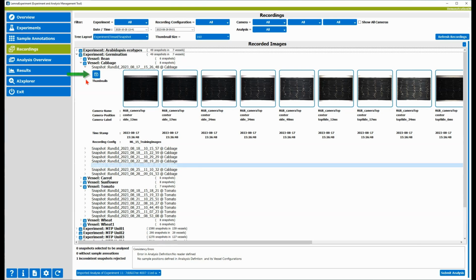You may have noticed the Save button besides the image thumbnails. With this button you can copy all images and data of a snapshot into a folder. This folder has the same name as the snapshot itself, but you can choose a parent folder for the snapshot folder. Effectively, you are exporting one snapshot to your disk. This will become important when we start to develop or modify analyses.